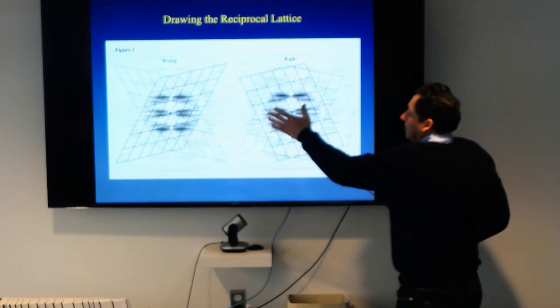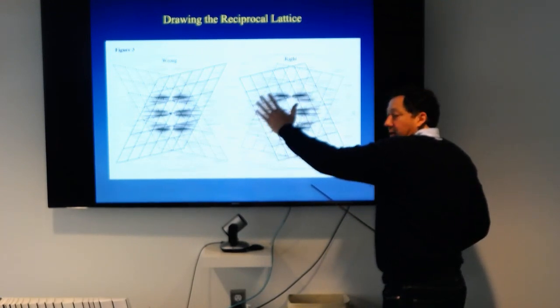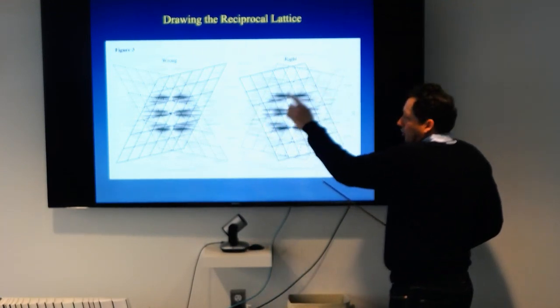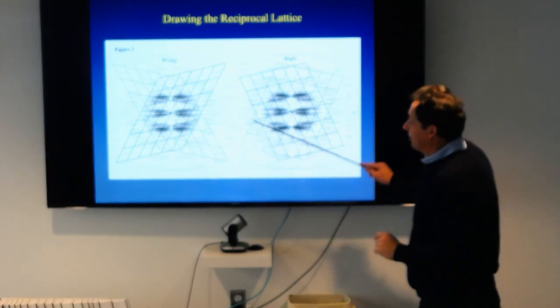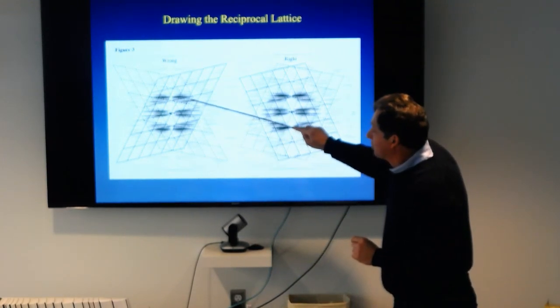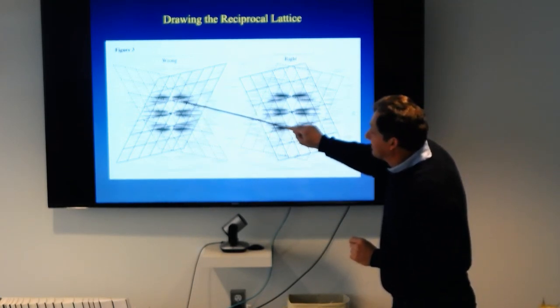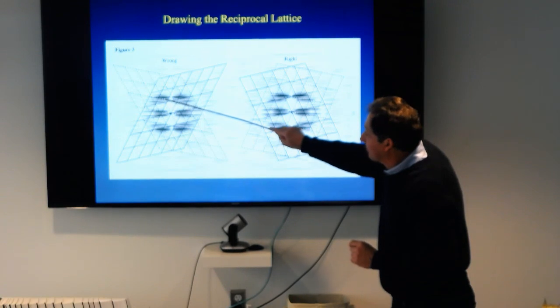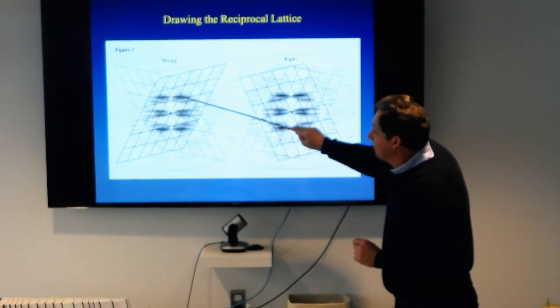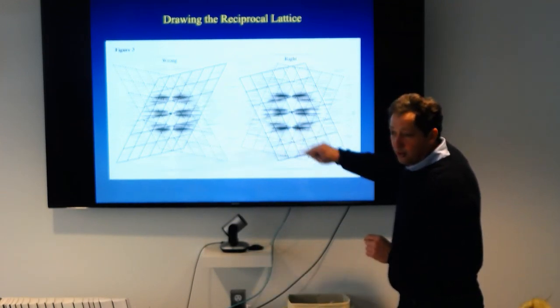And of course, there's going to be a lattice which will be the backside, which also will fit the other points. But you can get it confused because there are points back and forth, you don't know which one is which, and you can get a wrong lattice. Sometimes, for example, here, you have a major layer line in which no lattice points are going through it. Okay?